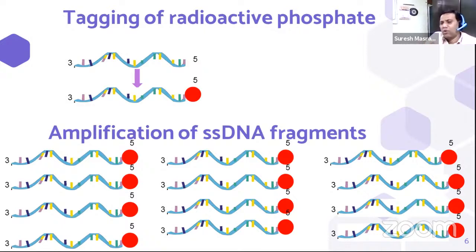Now, DNA sequencing also involves the gel electrophoresis stage. During this gel electrophoresis, to make this fragment visible over the gel or over the X-ray plate, because the gel is not used to exhibit the DNA fragment, we have to take this DNA fragment from the gel to the X-ray plate, and then the X-ray plates are processed for autoradiography, and during autoradiography, we can visualize the different bands which were earlier appearing over the gel.